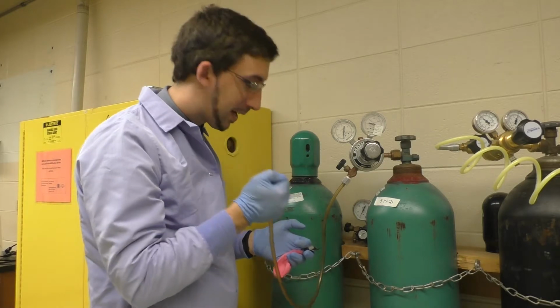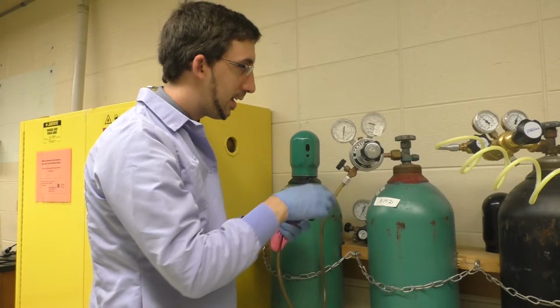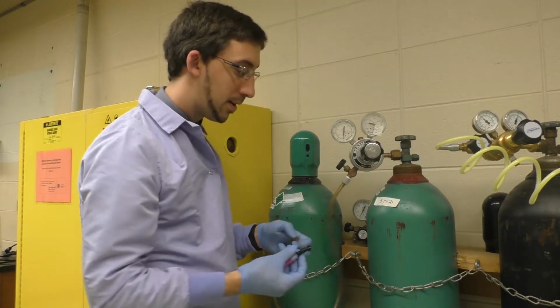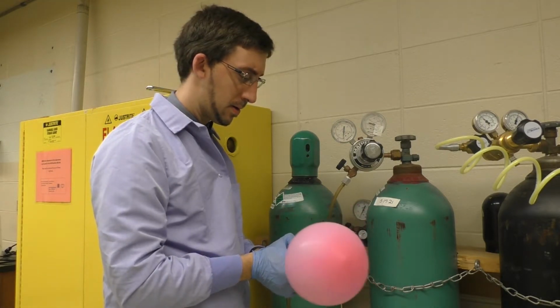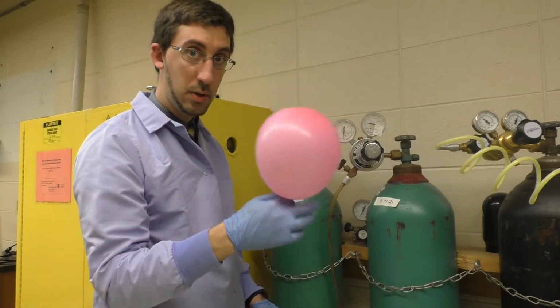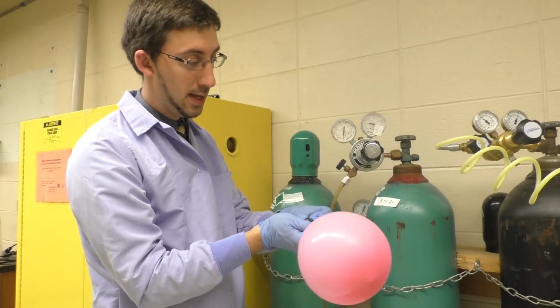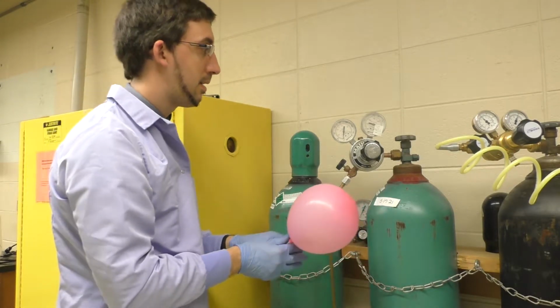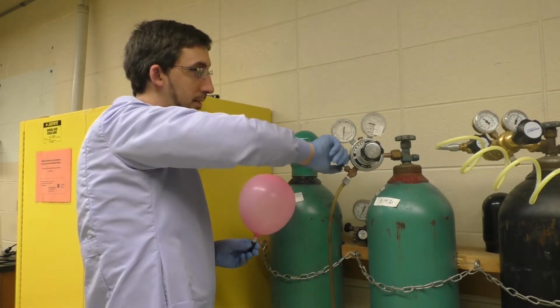And I can feel maybe just a teeny amount of pressure. I think I need to turn that up a little bit. Oh, there you can hear the hiss. We're getting a little bit of flow. And I've pinched off the balloon. I'll now seal up the end. I've turned off the pressure here. I'll now turn off the tank.